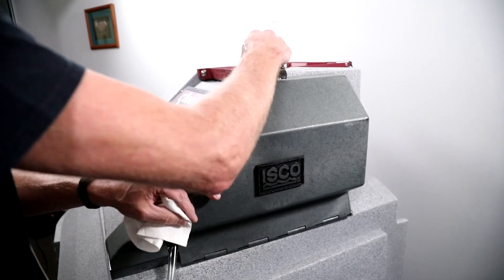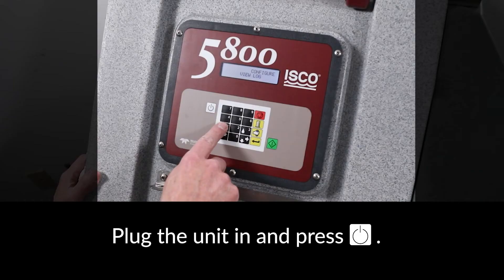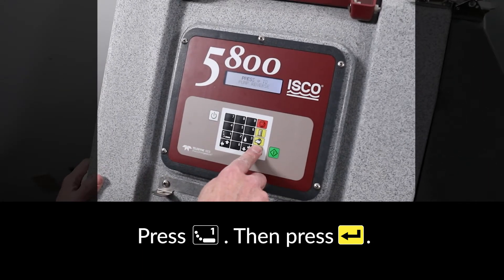Close and latch the side pump cover. Reapply power and then turn the unit back on. To test the pump in reverse, press the 1 key followed by ENTER.